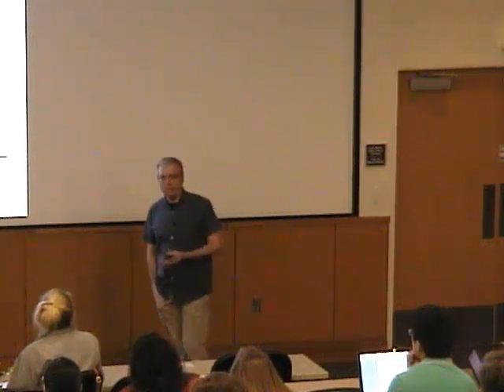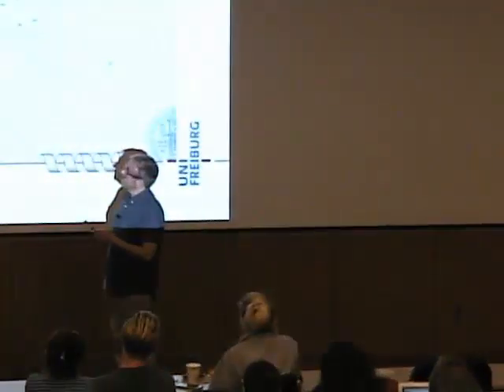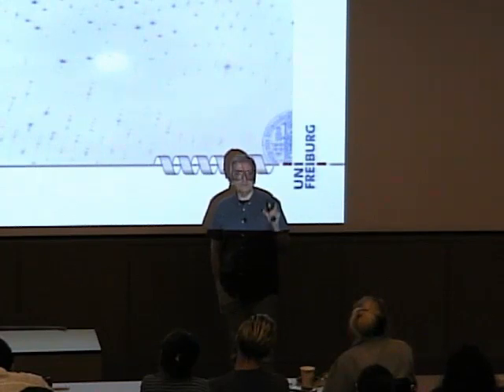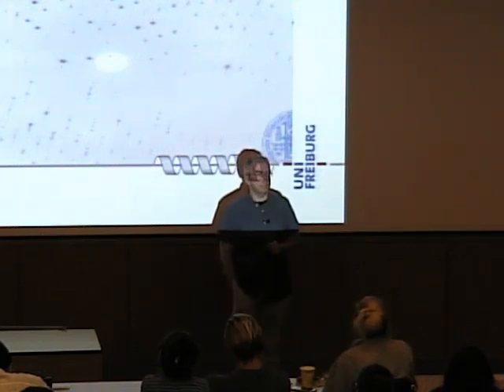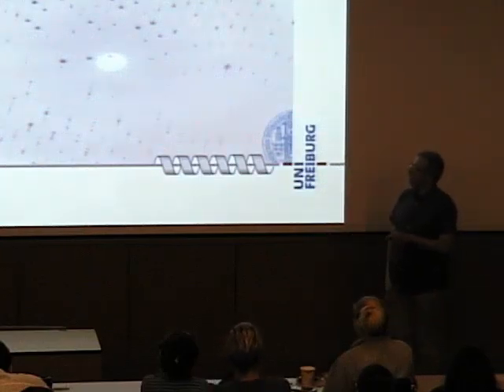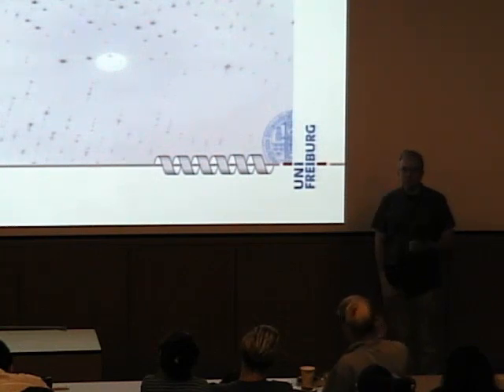Because it would have theoretically a third axis where it rotates, but that doesn't tell us anything because everything rotates at the same speed. So this is the data we measure, and the little arrow represents a wave, and each wave represents one black spot on a diffraction image. And what we do on the diffraction image is we measure the intensity of the black spot, and the intensity is, with a few corrections, just the square of the structure factor amplitude. So we directly measure the structure factor amplitude.